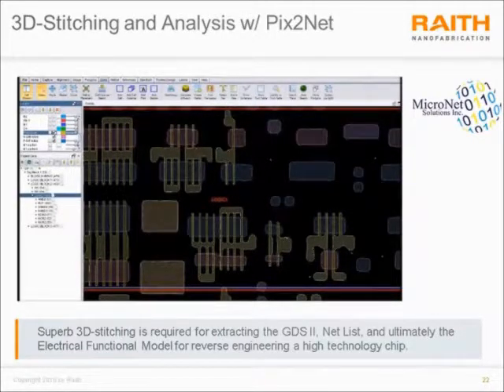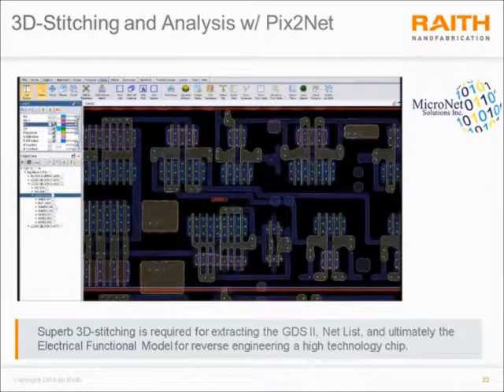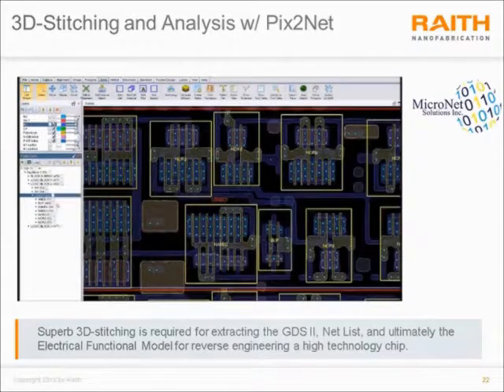So now we have a CAD design file essentially that has been extracted from these SEM images, and color-coded features are appearing in CAD for all 3 layers. So this CAD design file can be further analyzed to identify unknown circuitry. And so here the software has identified the Logic 1 library. And we can see that this Logic 1 library actually consists of a few different NOR, NAND, and buffer circuits.